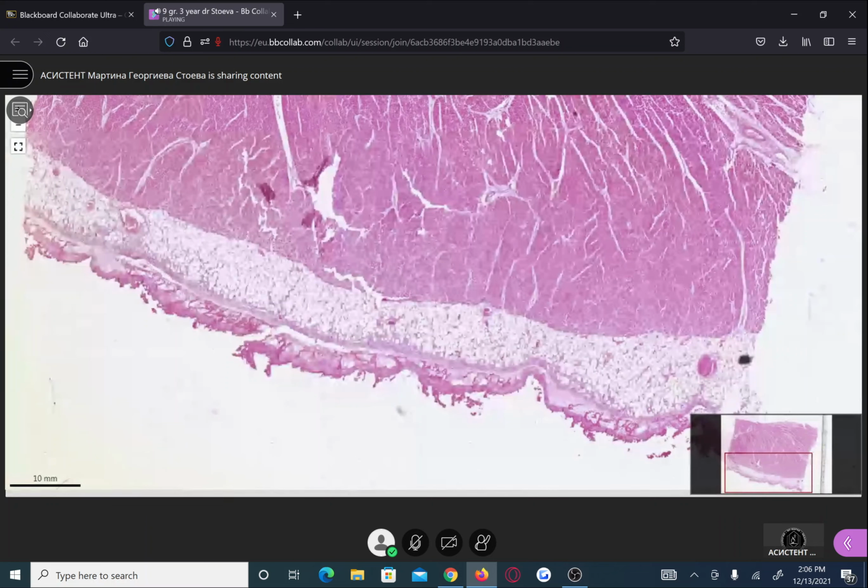So here, I would say that this is more an example of diffuse fibrinous pericarditis than a localized form, like it is when it's over an area of myocardial infarction. If you already had to look at the videos with the jars with gross specimens, this is one of the examination jars with gross specimen, the fibrinous pericarditis.